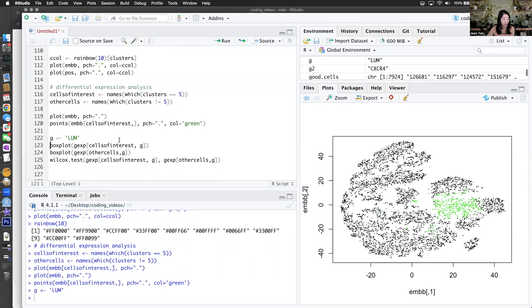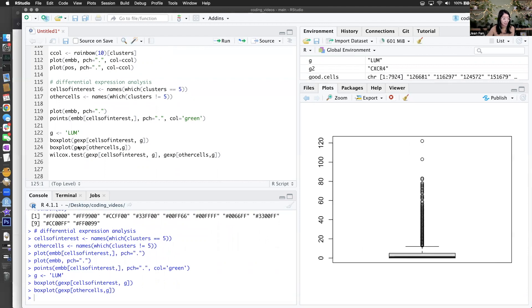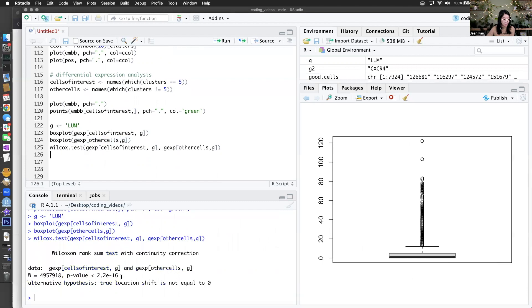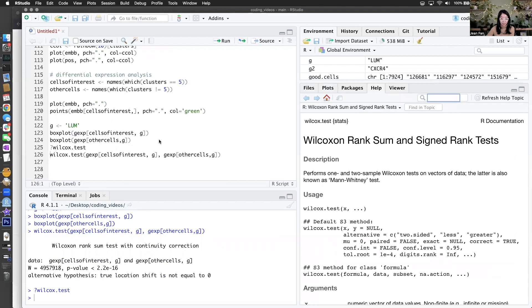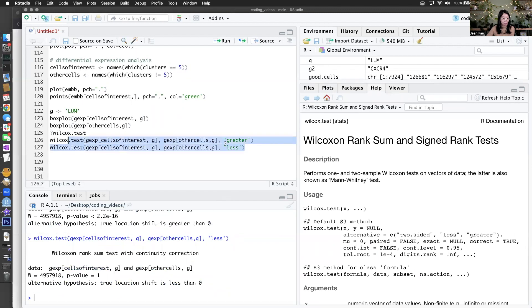LUM expression is much lower in the other cells. And now if I do a Wilcoxon test, it should be significant. Good. We actually probably want a one-sided test — we want to specifically look for things that are greater, because we want to find genes upregulated in cells of interest — we're looking for positive expression markers. If we do a one-sided test, we can distinguish between the genes that are significantly upregulated versus significantly downregulated.